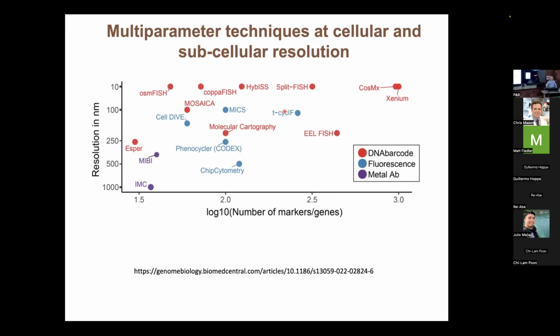Brain is also super autofluorescent. So there's some vulnerability for these techniques in that context, whereas with a metal-based approach, you don't have that problem because there is no autofluorescence. And I'll go into that in a second. And then obviously with DNA barcodes, you can go to a far greater plexing, depending on the technique you're using to look at that barcode itself.